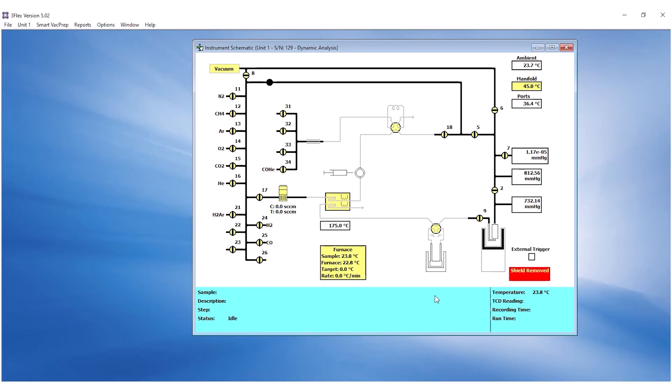Once the shield is placed, the Shield Removed sign on the schematic will disappear.